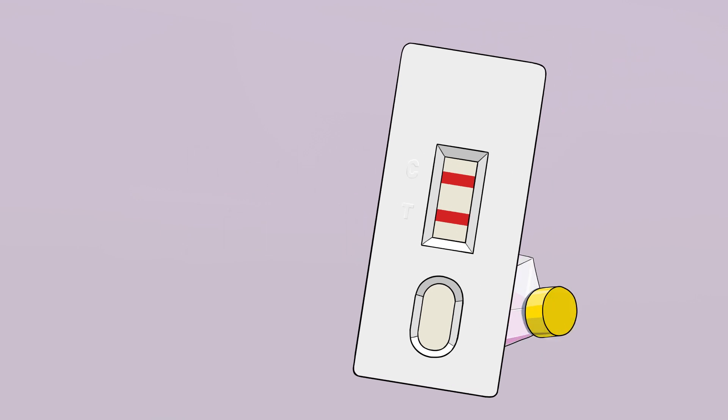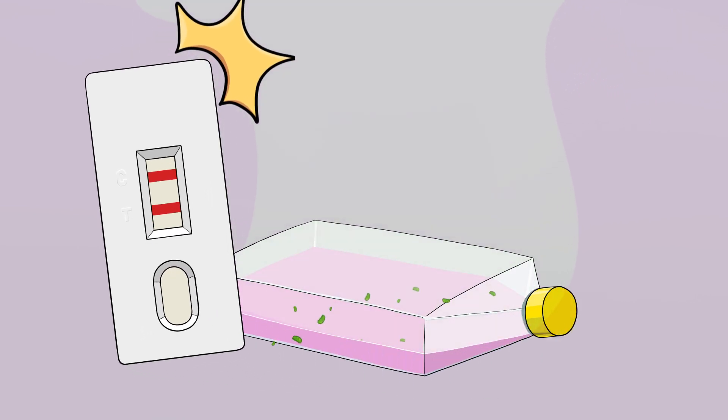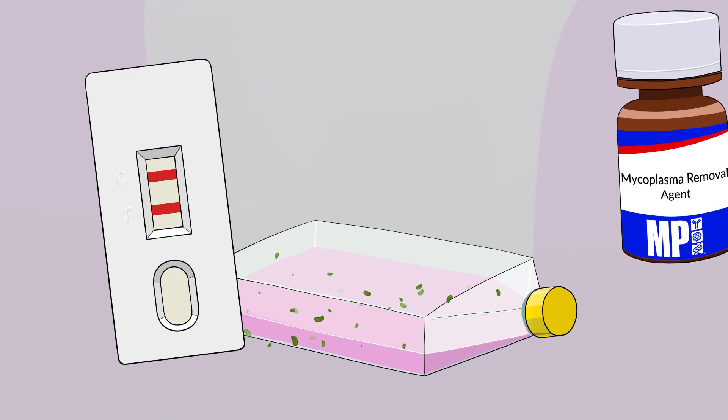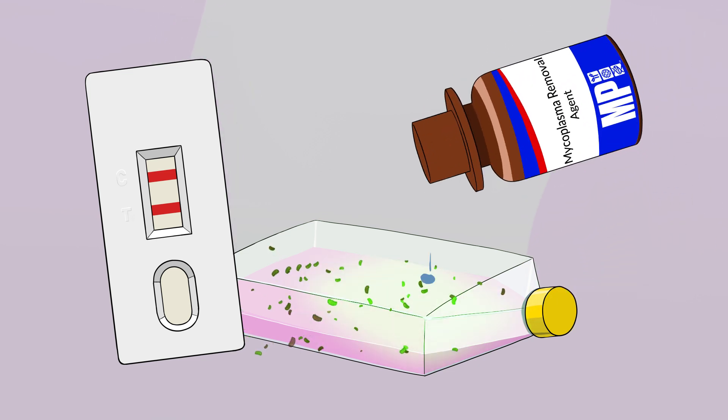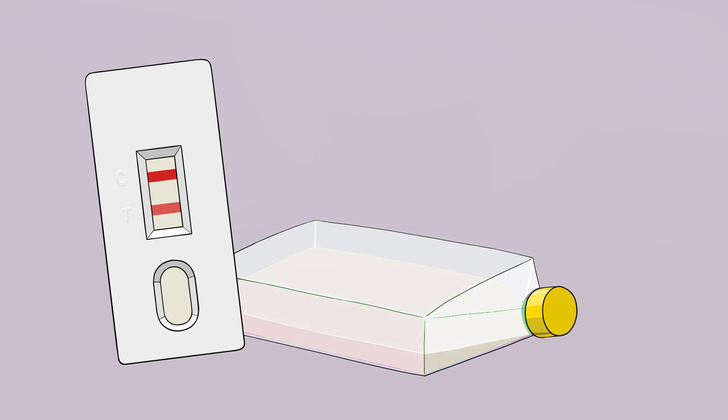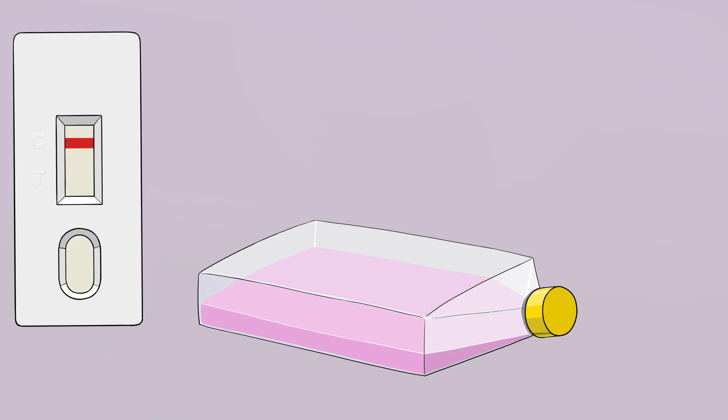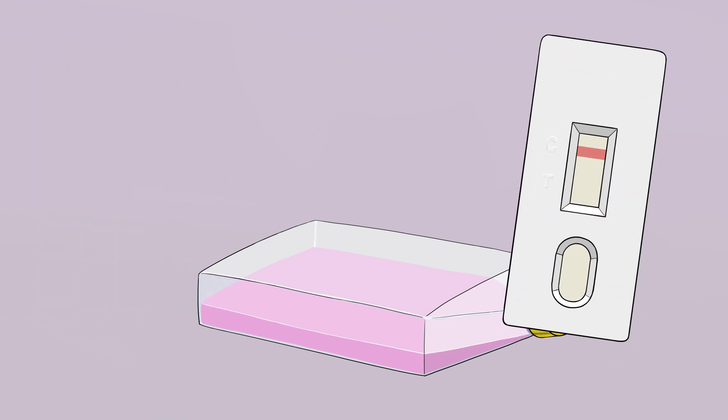If your test result is positive, don't panic. We have the solution for you. Your culture can be effectively treated with the Mycoplasma Removal Agent or MRA. Simply treating your cell culture with MRA allows you to swiftly combat mycoplasma contamination without losing your precious cells. After one week of treatment, retest your cell culture using MycoVisible Mycoplasma Rapid Test again.